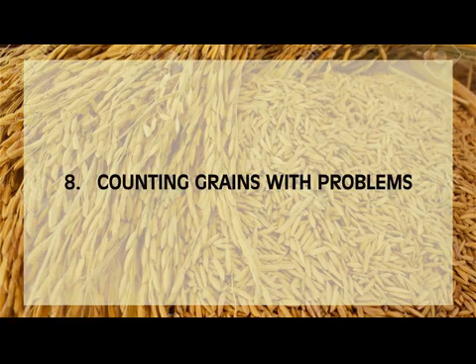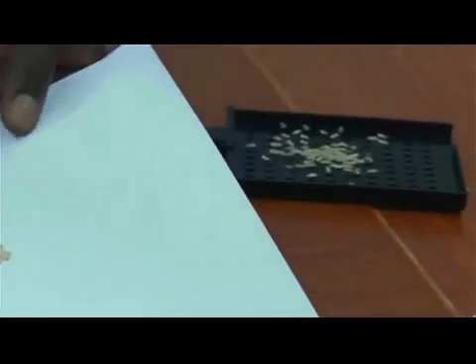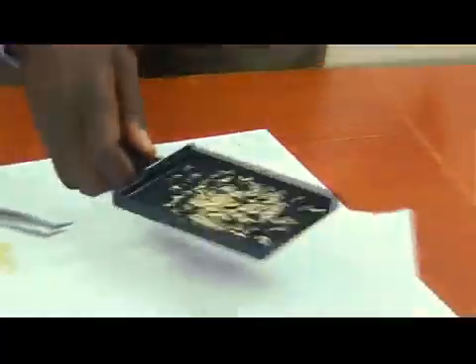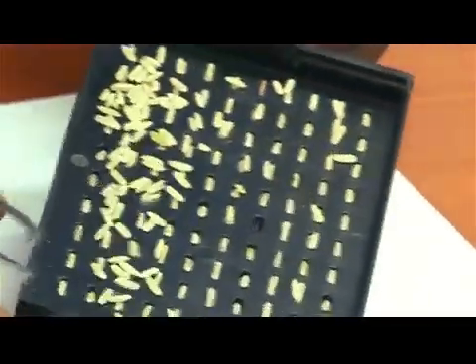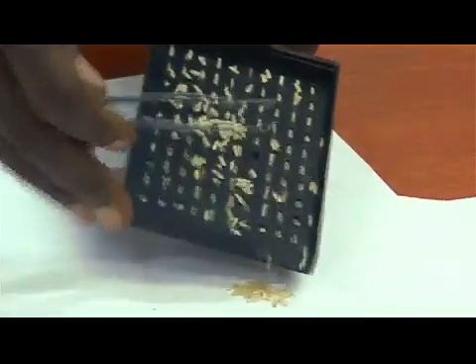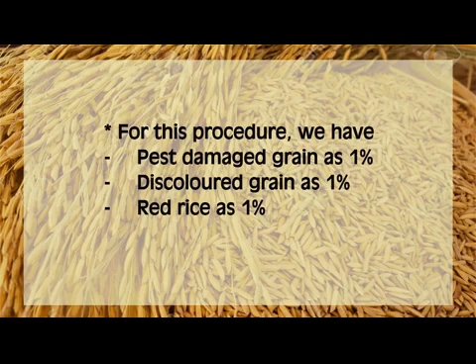Counting grains with problems. Put the separated whole grains in the grain counting pan and remove grains not fitted in the concaves. Make sure to fill all concaves. The counting pan has 100 concaves, so you can directly know the percentage of problematic grain types by merely counting them. For this procedure, we have pest-damaged grains at 1%, discolored grains at 1%, and red rice at 1%.